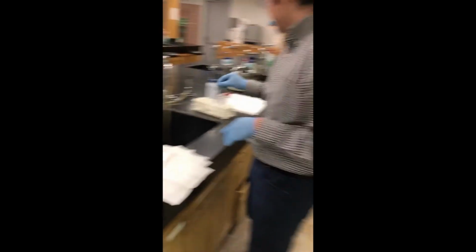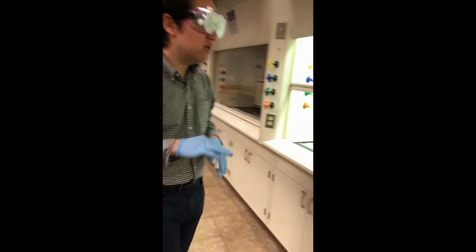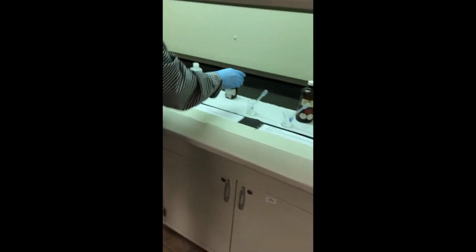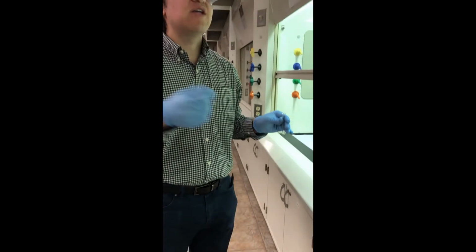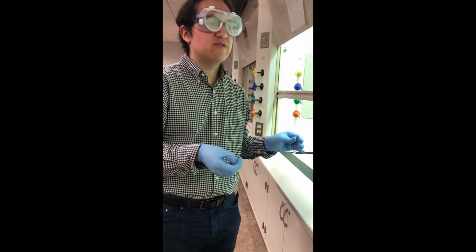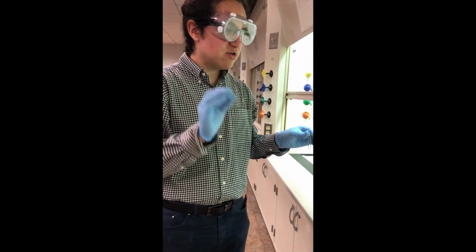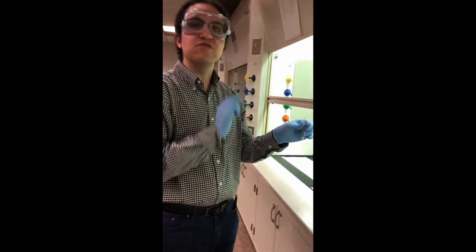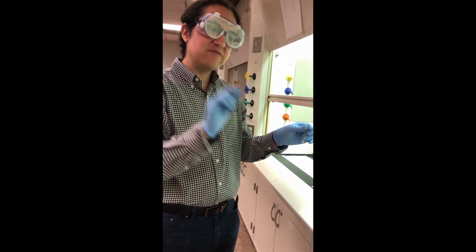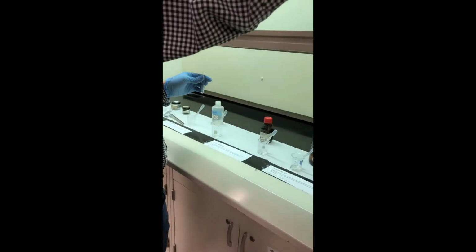Now what we're going to do is we're going to react our copper sample in test tube 1 with concentrated nitric acid. This is a redox reaction that generates toxic gas. So as a result, we're going to turn on the fume hood. What I want you to observe is after the addition is complete, observe the color of the solution, and then I'm going to add a few drops of deionized water, and I want you to observe the color of the solution once again. I'll be turning on the fume hood at this time.